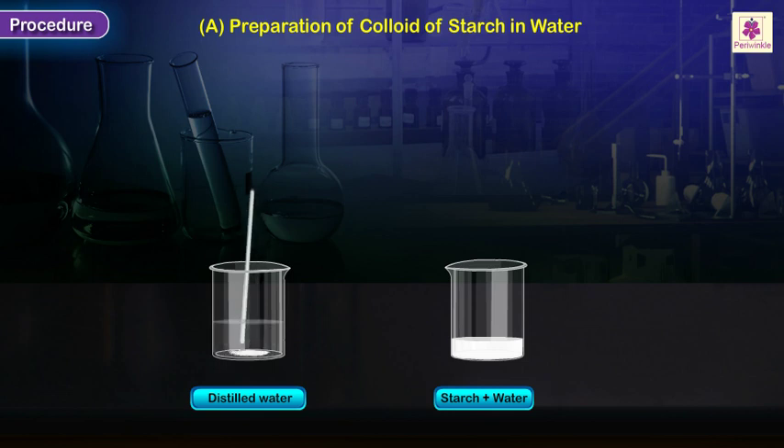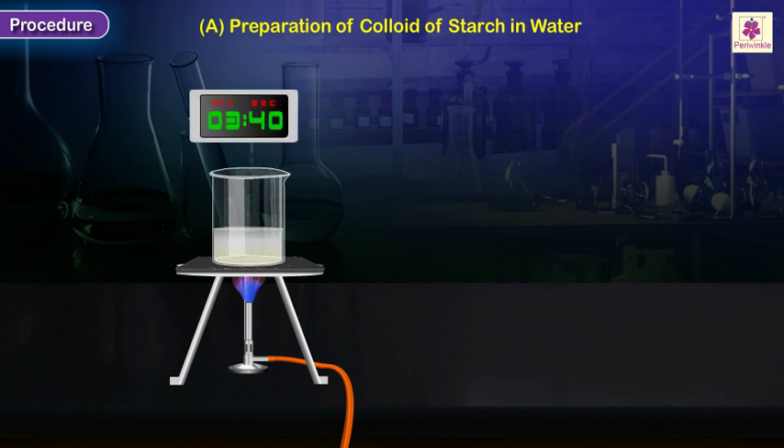Stir the contents thoroughly till the paste-like mass of starch disappears. Heat the mixture for about 8 to 10 minutes.